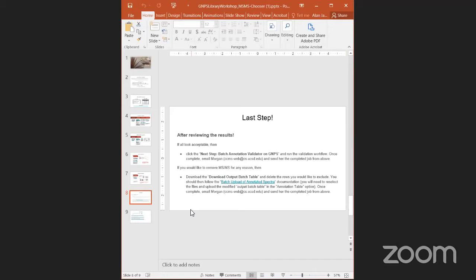I mean, when we do matches against the metabolomic data sets, they're all putative anyway. And so if they become important, you need to verify it subsequently in different ways and do a deeper inspection anyway. So that's the important part.